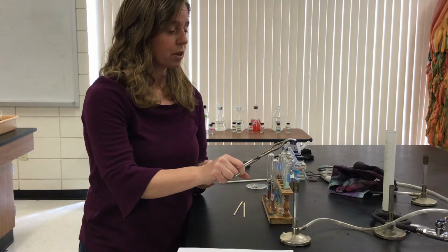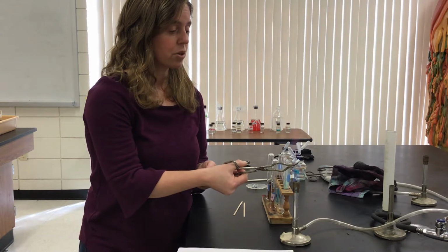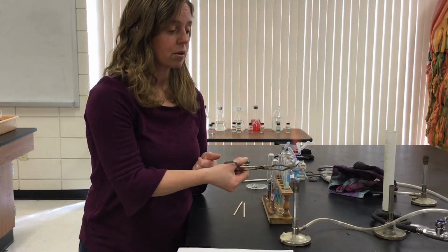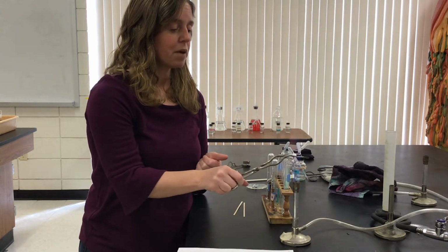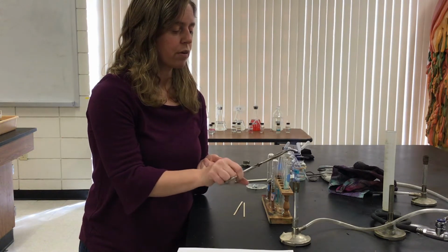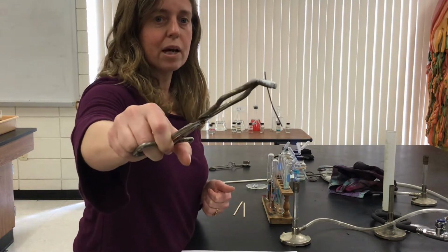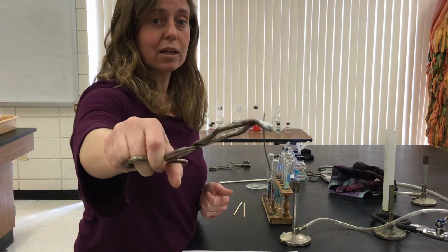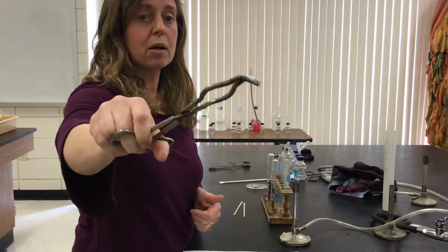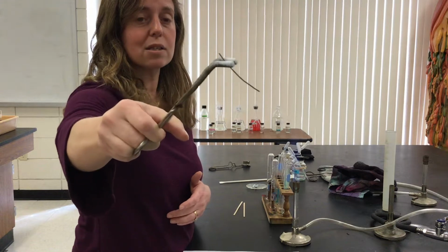So the very first one that we're going to do, you'll notice as I'm heating it, it's going to get real red in color. So you have this shiny metal, and now you can see it's getting a little red, it's getting really hot, okay? And then after you do it for about a minute, I'm not going to do it a full minute because of time constraints. So I'm just going to turn it over here and there. And now as you can see it, okay, can y'all see that? It's not shiny anymore. It's more like black in color, okay? So it turns from a shiny copper color to a black, almost like soot is on top of it, all right? So that's my synthesis reaction.